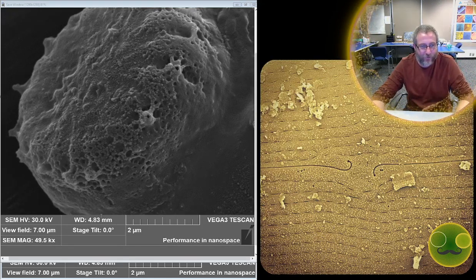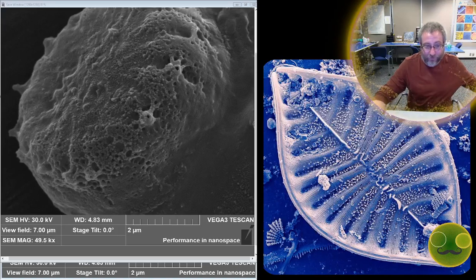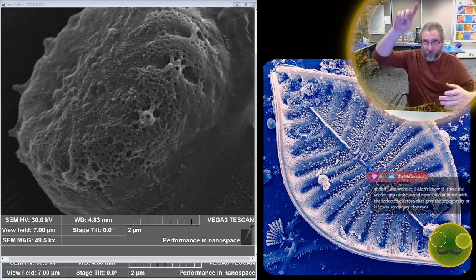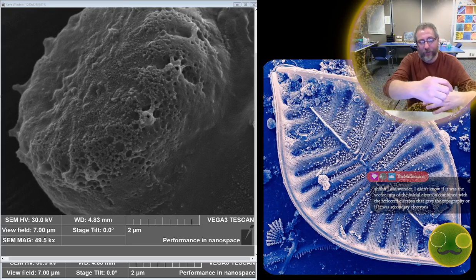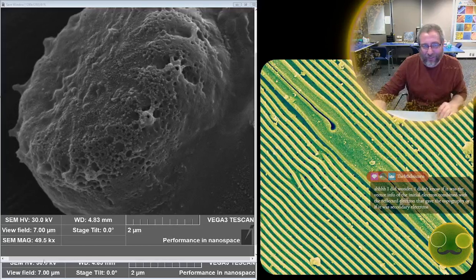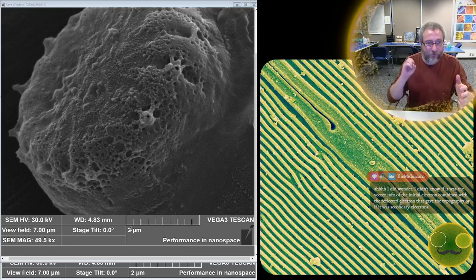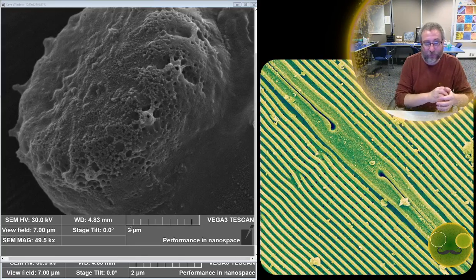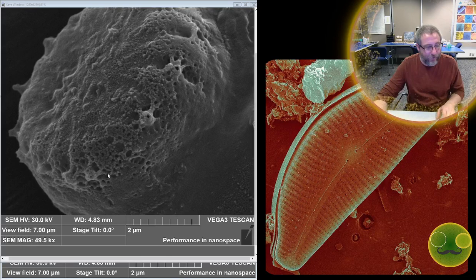The secondary electrons are the ones giving us the topography of our image. So the secondary electron detector: the beam fires electrons down, they hit the sample, and it knocks electrons out of the specimen, whatever's under the beam. The secondary electron detector is basically like an eye. It detects the volume of electrons that hit it. It has a positive charge, so electrons are pulled towards it, and it captures how many hit, and that gives us the brightness of every pixel, basically.